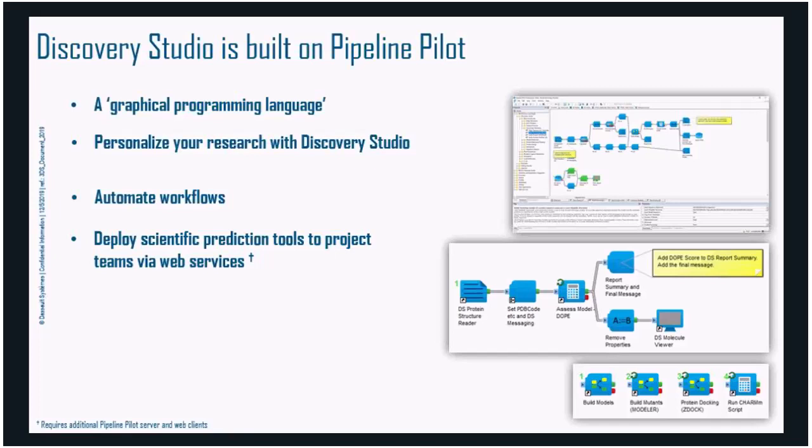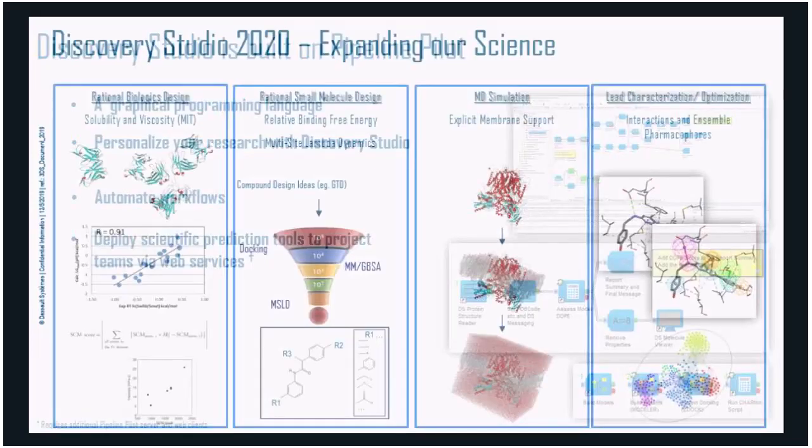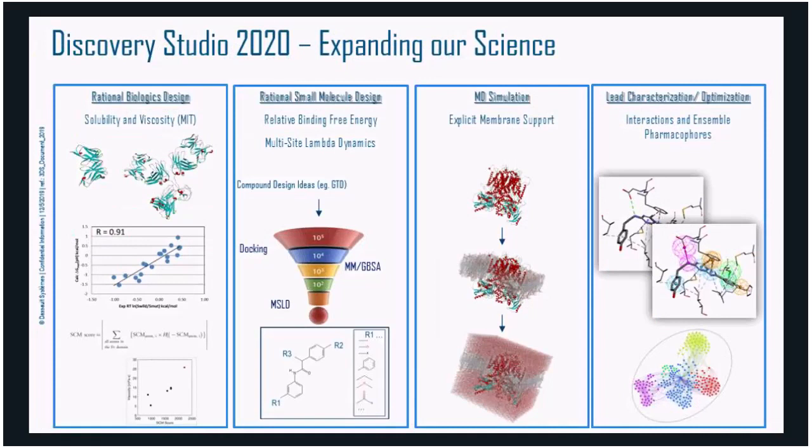But I should note that if you want to use this web client, this does require additional Pipeline Pilot server hardware. It doesn't come with a purchase of Discovery Studio by itself. So that's a little bit of the overview of what Discovery Studio is.